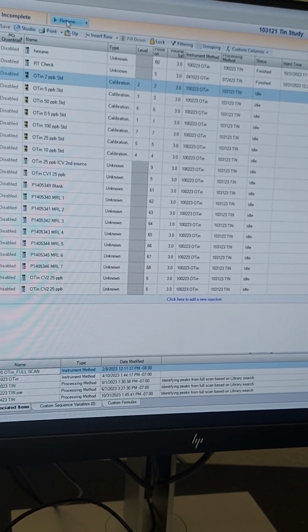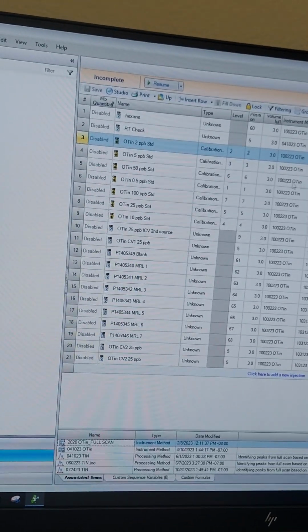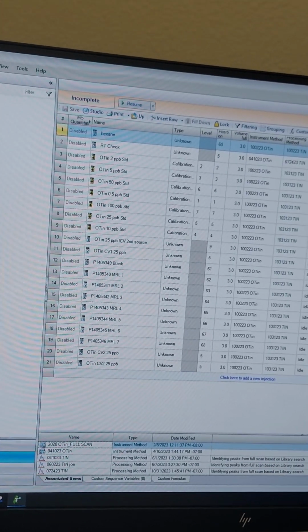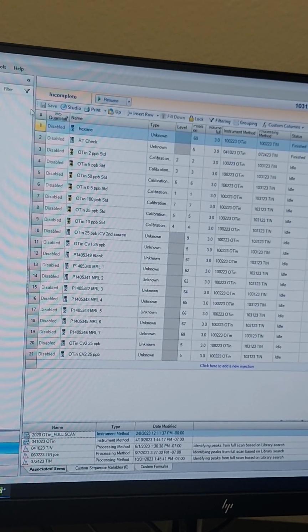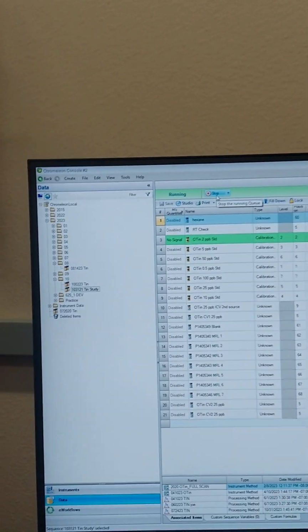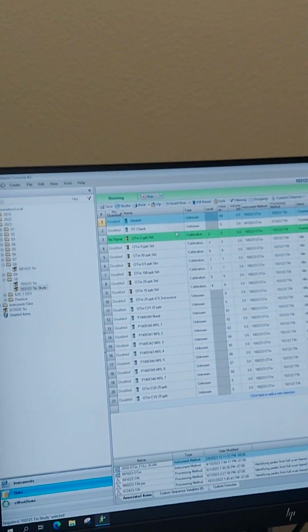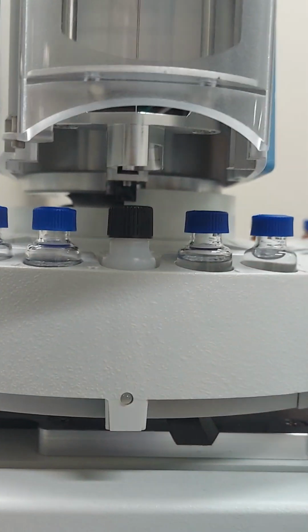And we'll just start. You only mark one row? You don't need to mark anything. It'll just go to the start first in idle one. We already saved. All right. And you don't need to add solvent for the needle, hexane or something? In the wash? I already did because I did this earlier. So it's refilled here? Hexane in all of these four. Okay.